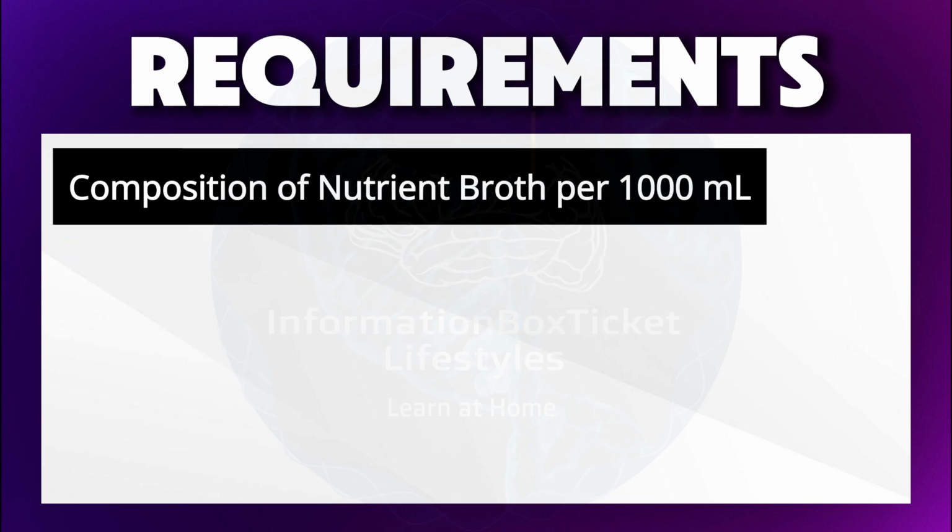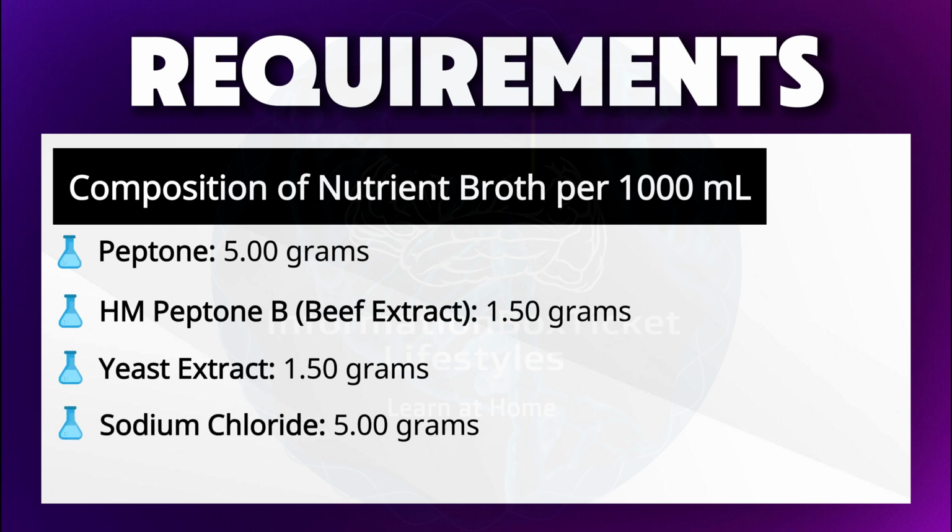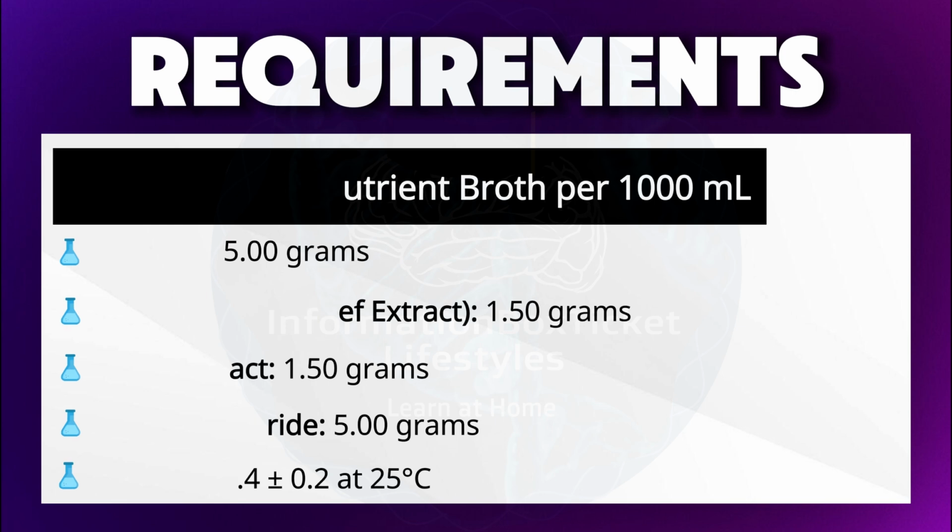Composition of nutrient broth per 1,000 ml. Peptone, 5.00 grams. HM peptone B, beef extract, 1.50 grams. Yeast extract, 1.50 grams. Sodium chloride, 5.00 grams. Final pH, 7.4 ± 0.2 at 25 degrees Celsius.